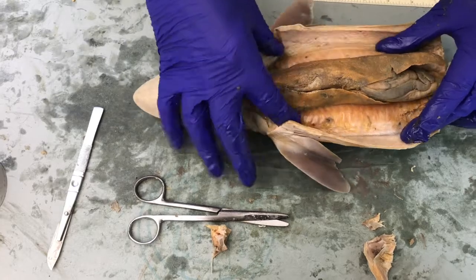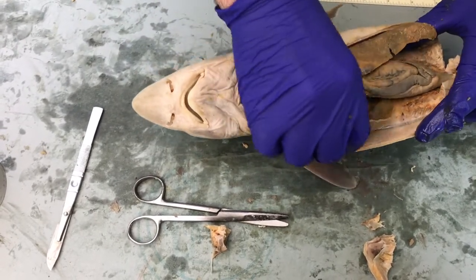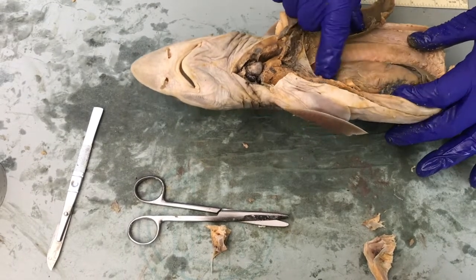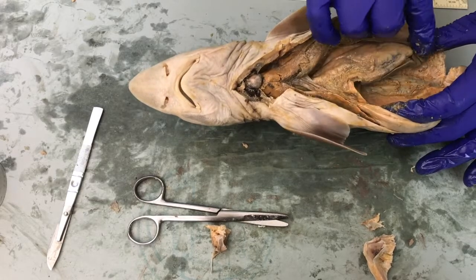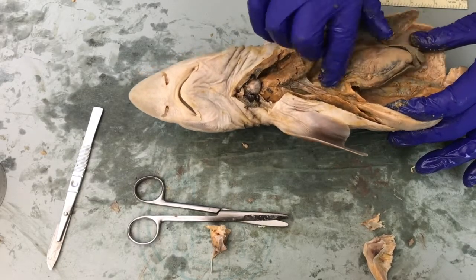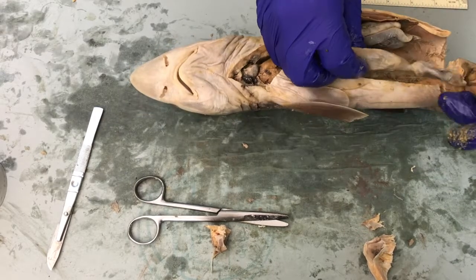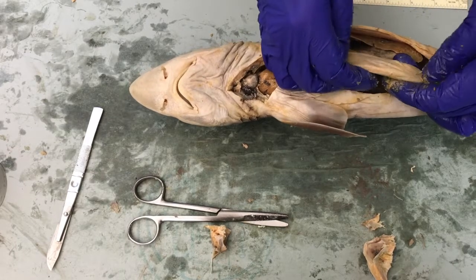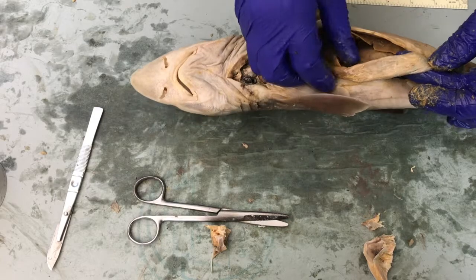Take a look at the main organs here again, the liver. Take that off to the side. And here's the stomach, has a little bit of something in there. We'll take a look at what that is. The spleen down here, a little bit of the pancreas up here, and then this is the intestine that was kind of caught in there. And this is known as the spiral valve intestine, and it's a little hard to see, but there are little ridges in there.